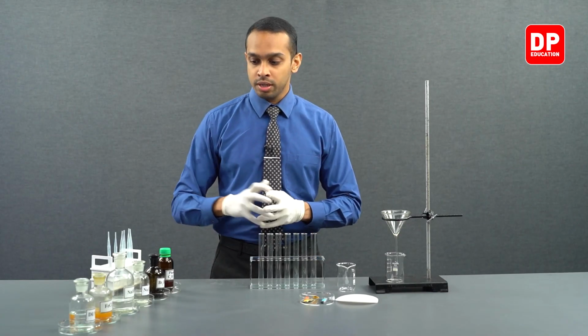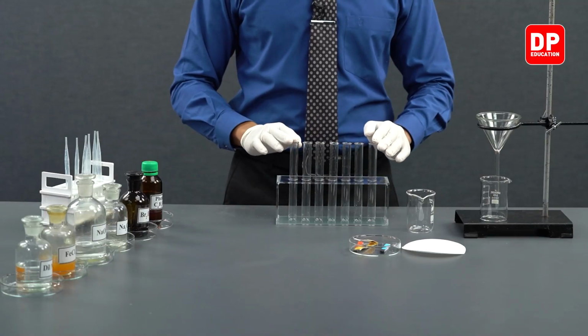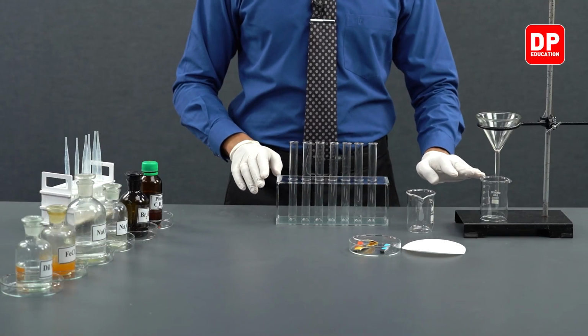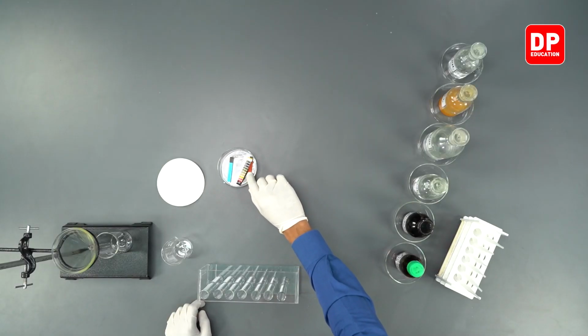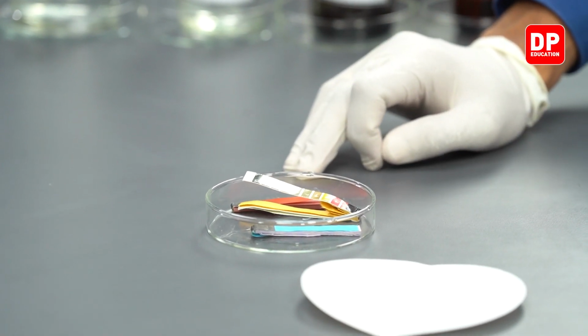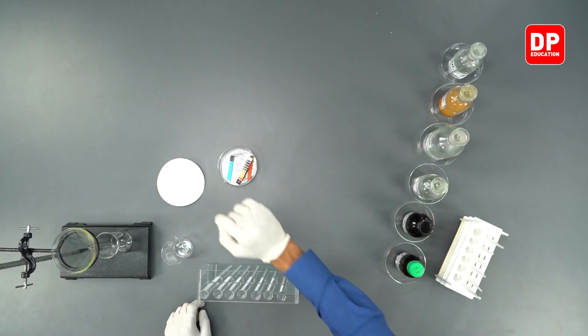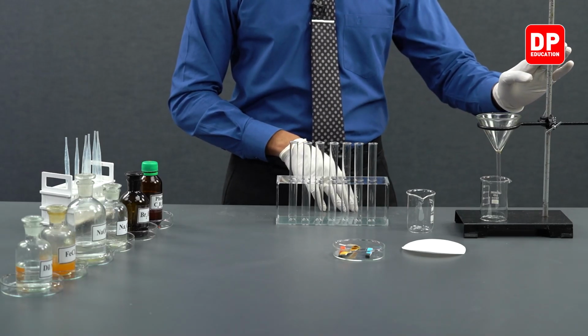Apart from those chemical reagents, we will be using droppers, test tubes, 2 beakers, and we have our red litmus, our blue litmus, and pH paper. We will be using a filter paper, a funnel, and a retort stand.